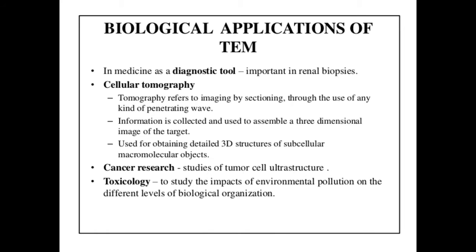And in cancer research also, it gives its contribution. It is used to study the tumor cells' ultrastructure. And in toxicology also, this is used to study the impacts of environmental pollutions on the different levels of biological organizations.